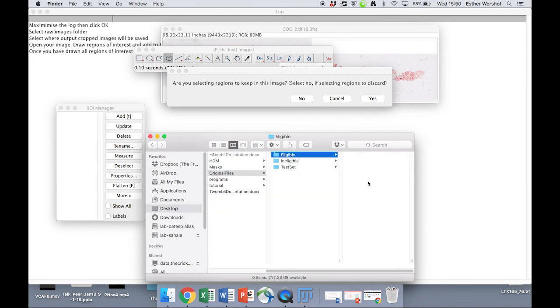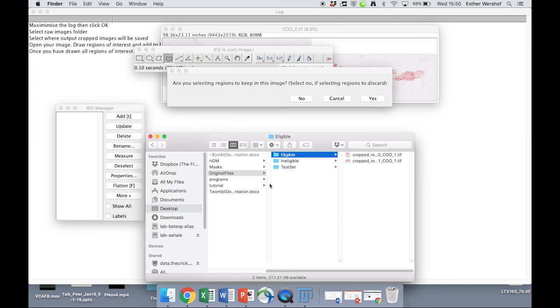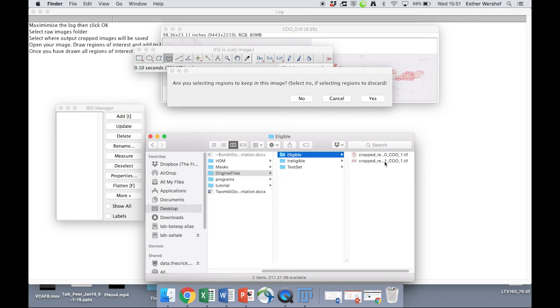So we're no longer doing the tutorial. And we're going to put those original files - we've had a look, we know that they are good quality - so we're going to put them in the eligible folder. And we're then ready to, in due course, run the Twombly pipeline on these images, where masks can be saved here and HDM can be saved in here.